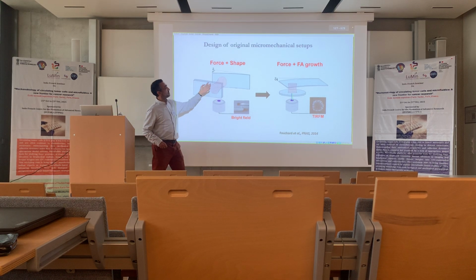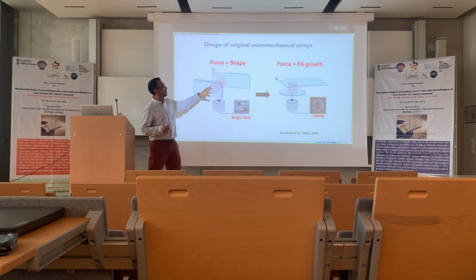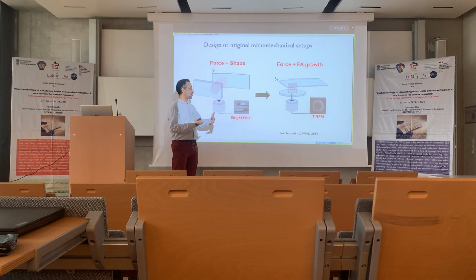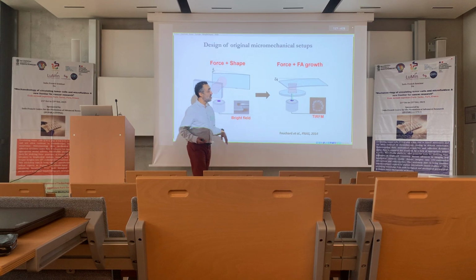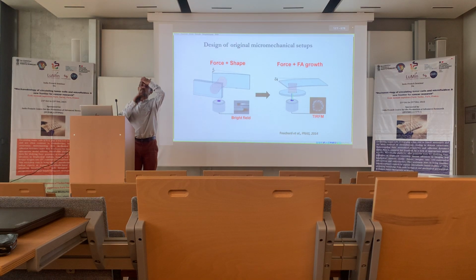So, custom-made cantilevers to quantify single animal cell mechanics, but I will talk also about plants. And we can couple these with different ways of showing the cell: either just bright field, where you can see the shape of the cell, or we can even go to TIRF and confocal and have more details and couple mechanics with this kind of imaging. I will focus today on the simplest one, the lateral view, and just mechanics.